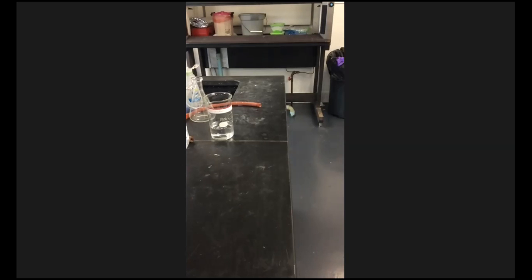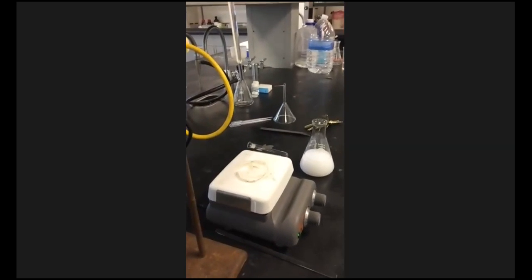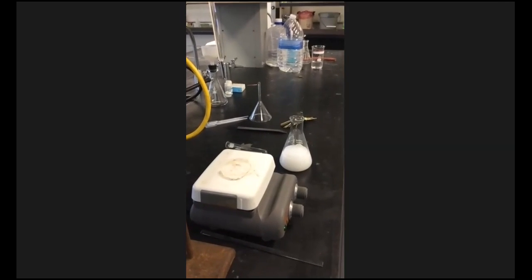So I'll just move the camera back to here. I'm going to put it on this hot plate, and this is going to be the worst 15 minutes of your life. So I apologize in advance, but we got to do the digestion step. We got to do it the amount of time it calls for, so that when the calcium oxalate comes back out of solution, we get the maximum yield. If we don't do this step, then the number that we get is going to be off. The percentages in the salt are going to be off also. So if that's off, then everything is off.